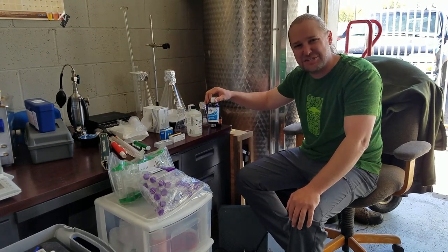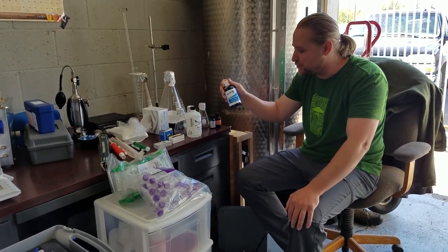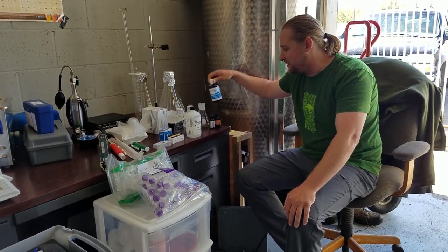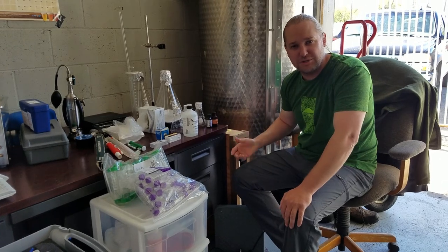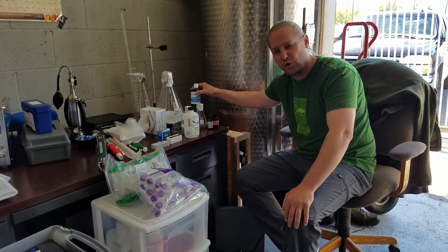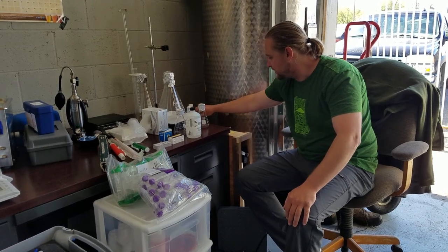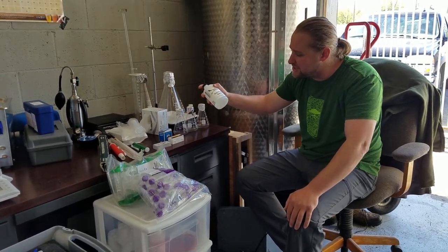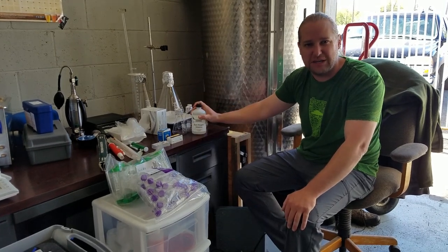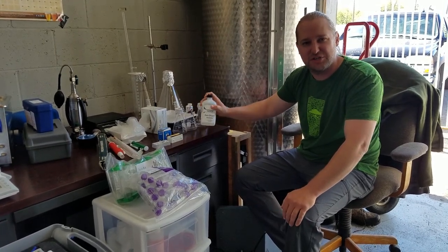We have our pH electrode storage solution — I think it's a 3 molar potassium chloride solution. We also have our buffer solutions, our calibration solutions for the pH, along with the storage solution. And here we have a zero oxygen solution, just so we can check our dissolved oxygen meter and make sure it's reading within the zone we like.